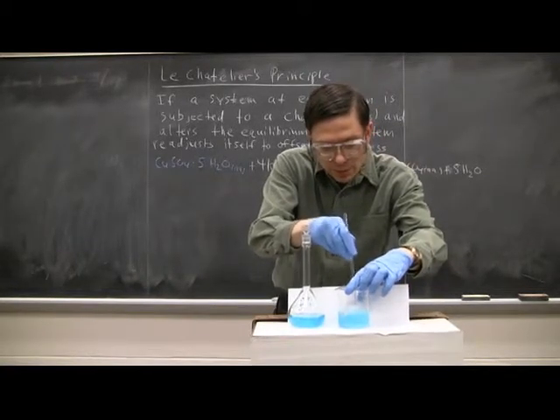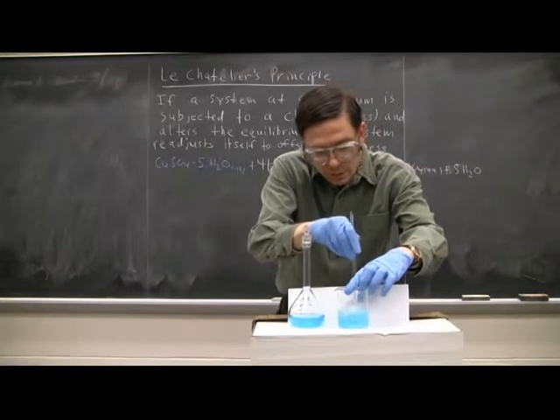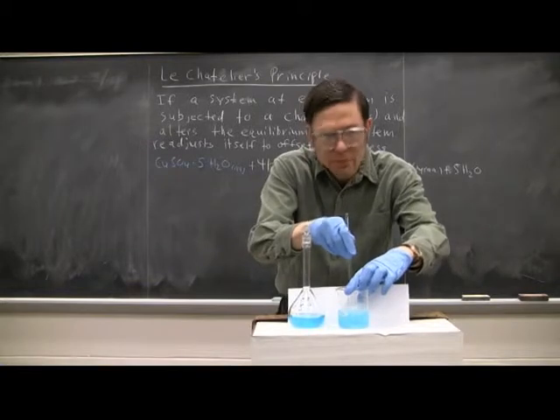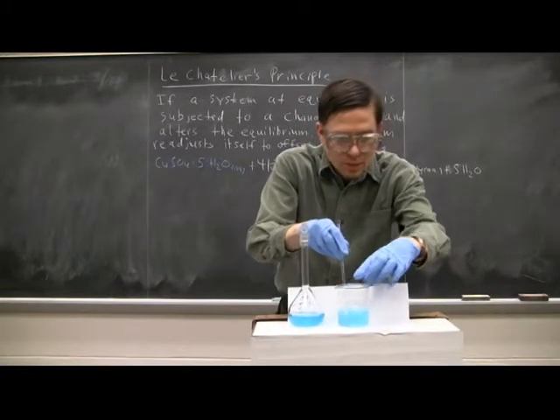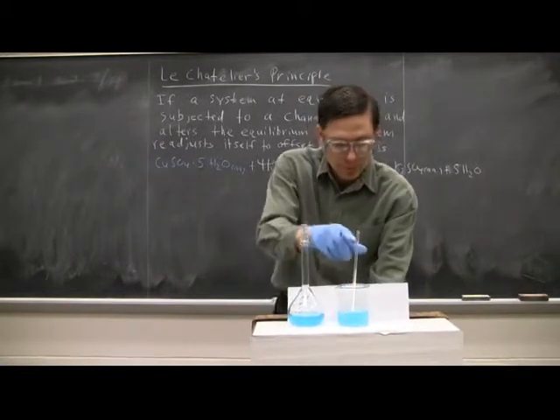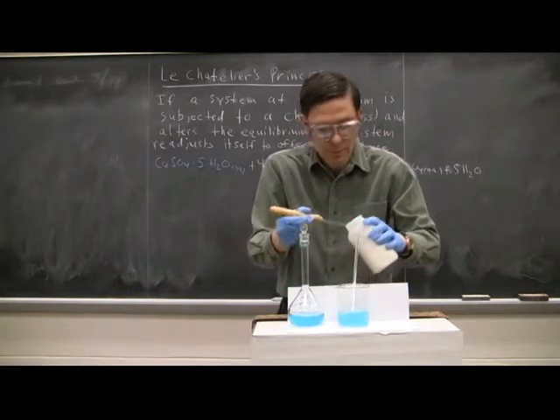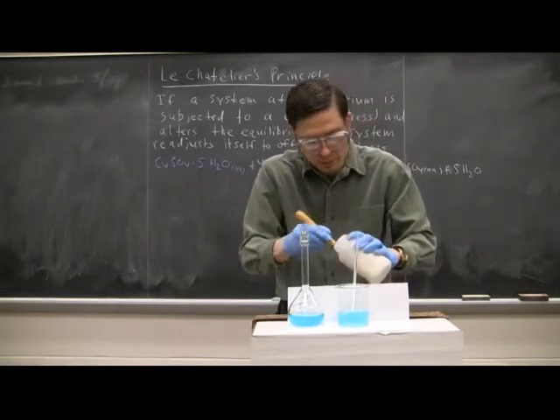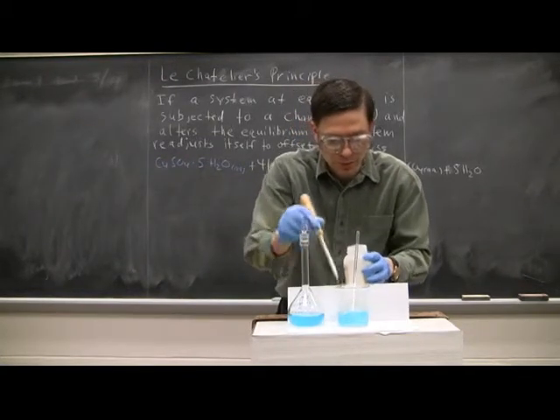You can already see it's getting a little bit lighter. Just want to make sure it all dissolves in here nicely. I'll add a little bit more.